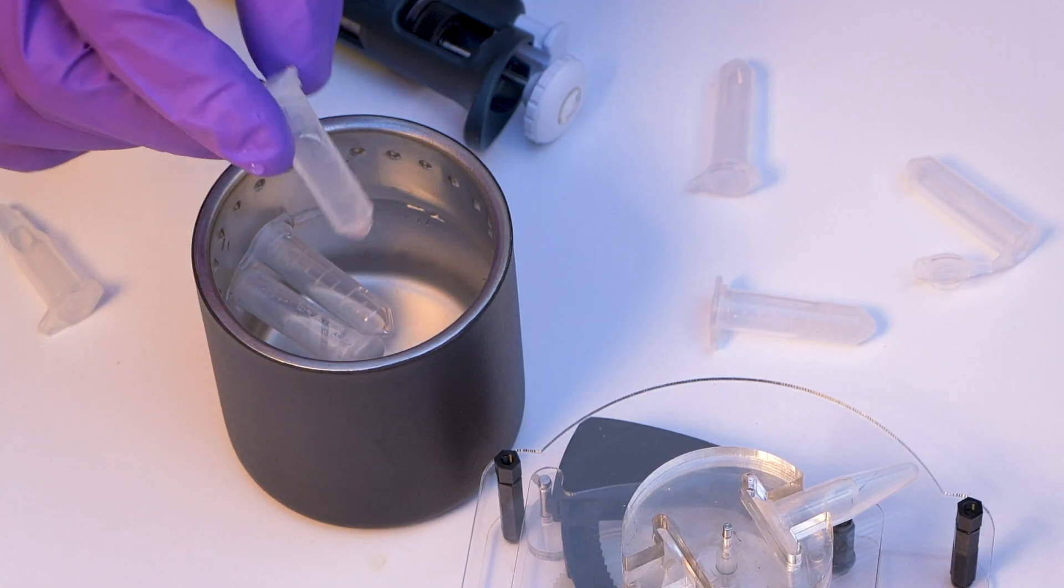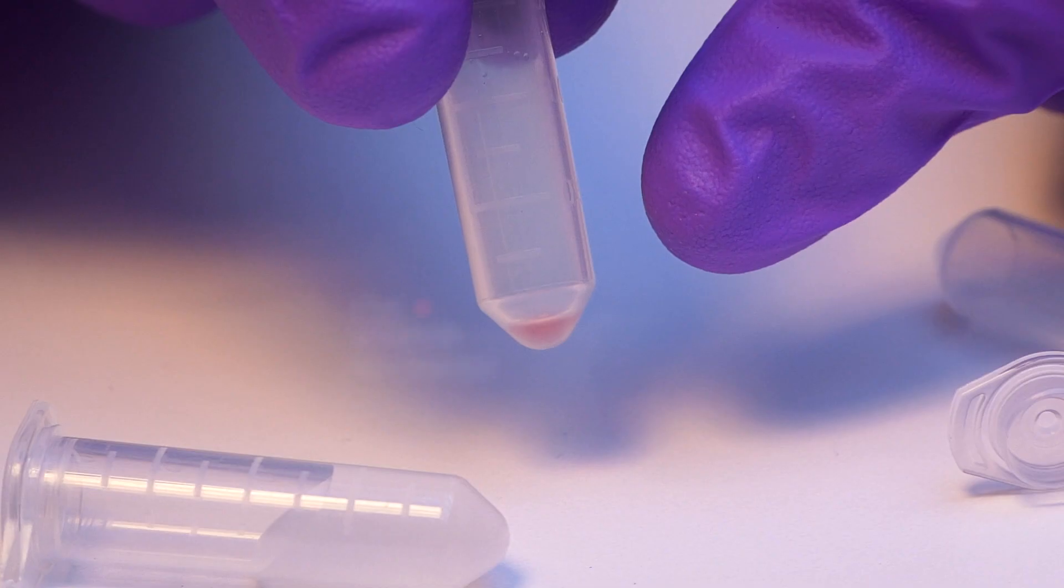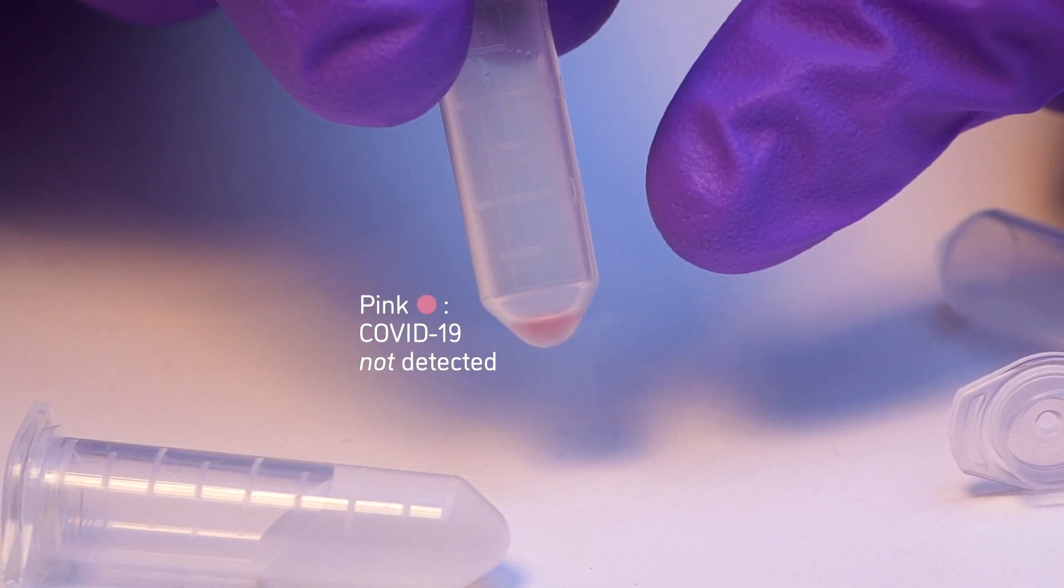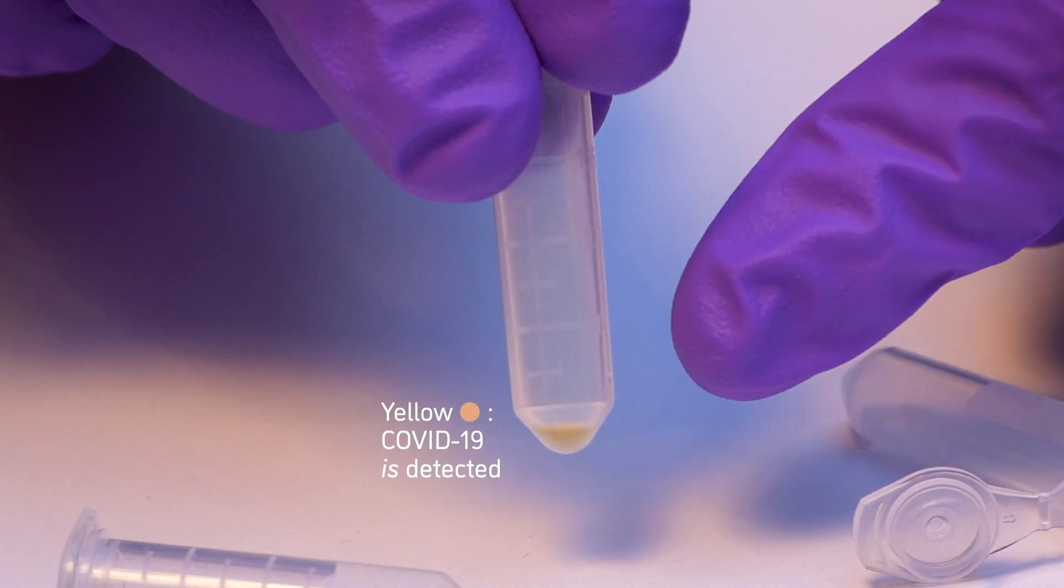So at the end of the 30 minutes, we can check. If there's no viral RNA present, the reaction mixture will stay pink. If there is viral RNA present, you'll see this pH change, and the reaction mixture will change to this yellow.